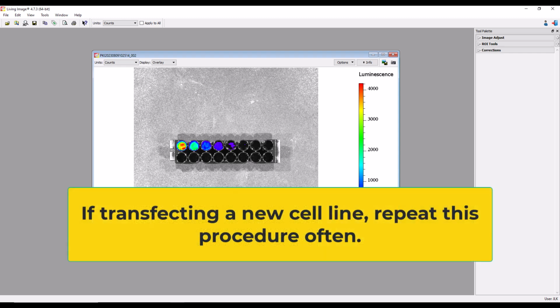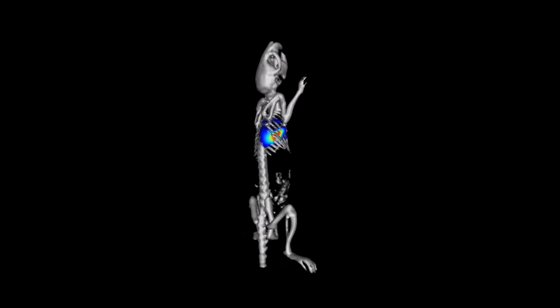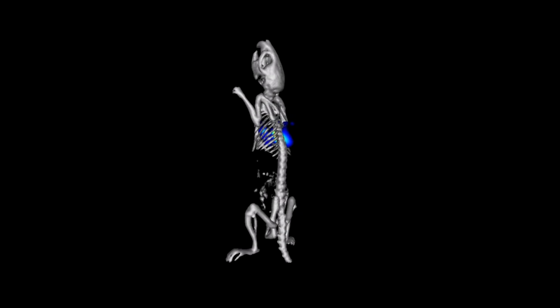When transfecting cells for the first time, please ensure that you repeat this procedure a few times a week to assess the stability of expression over an extended duration of time. Also ensure that you test their growth and viability and directly compare to the parental strain to elucidate the impact of any transfection on cells. Furthermore, such in vitro assessments of light output in transfected cells also offer valuable information on stability of light activity and potential in vivo sensitivity before you move into imaging live animals.